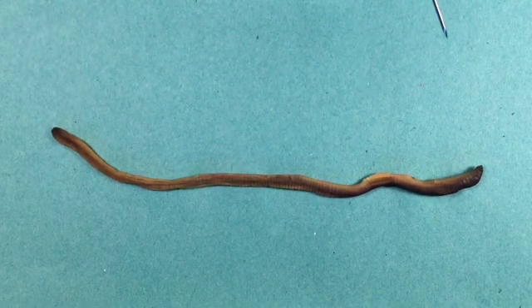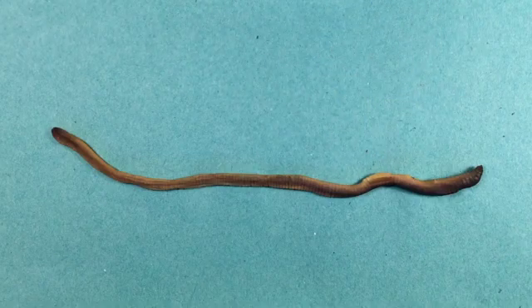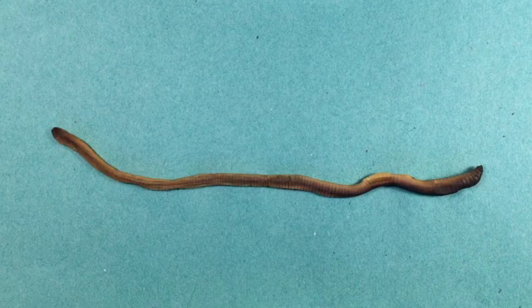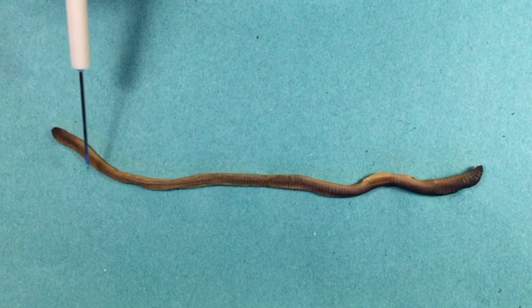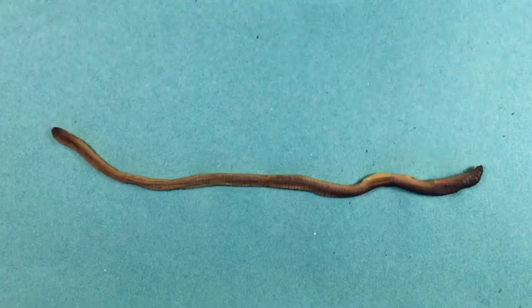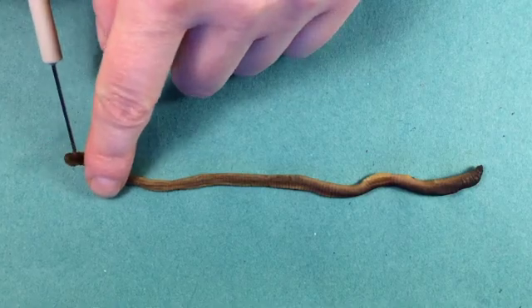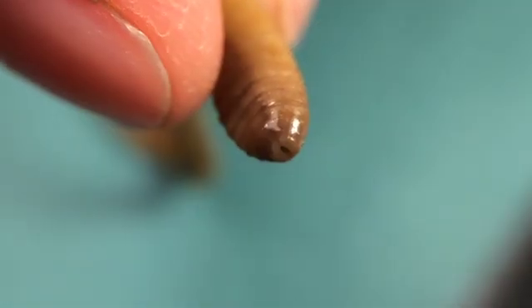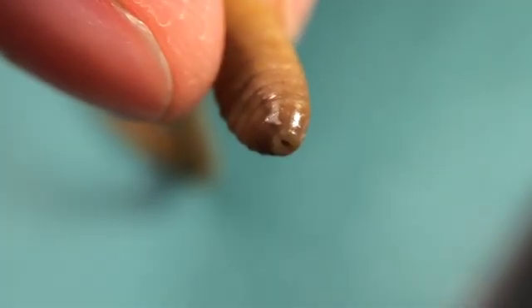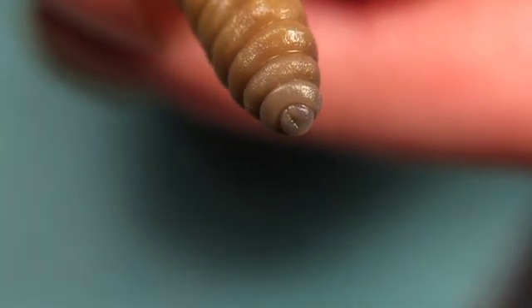A lot of worms that you dig up in the garden aren't sexually mature, in which case they won't have a clitellum. So we need to look at some other features to help us orientate the earthworm. If we look at the posterior section, we can see the posterior end is slightly flattened compared to the anterior end, and we can see that it actually ends in an anus.